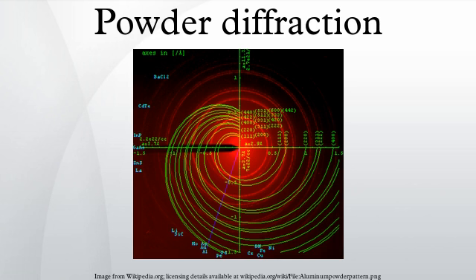Comparison of X-ray and neutron scattering. X-ray photons scatter by interaction with the electron cloud of the material, while neutrons are scattered by the nuclei. This means that, in the presence of heavy atoms with many electrons, it may be difficult to detect light atoms by X-ray diffraction. In contrast, the neutron scattering lengths of most atoms are approximately equal in magnitude.